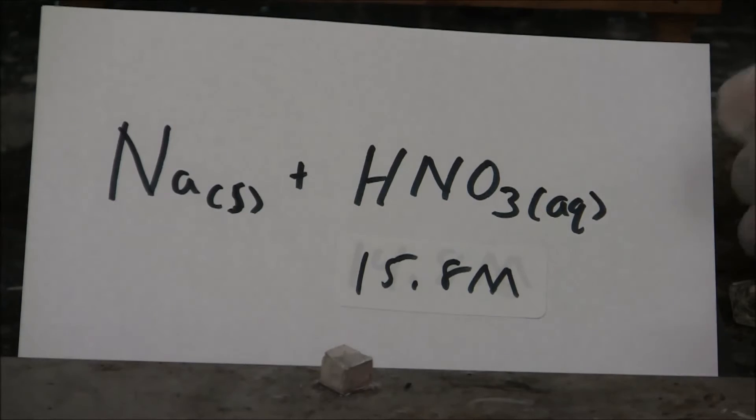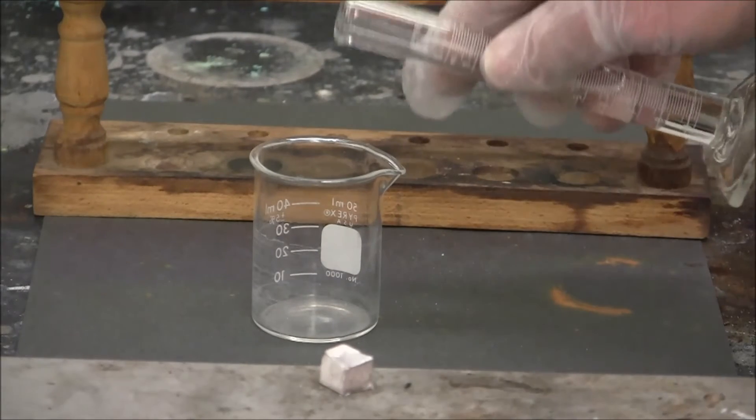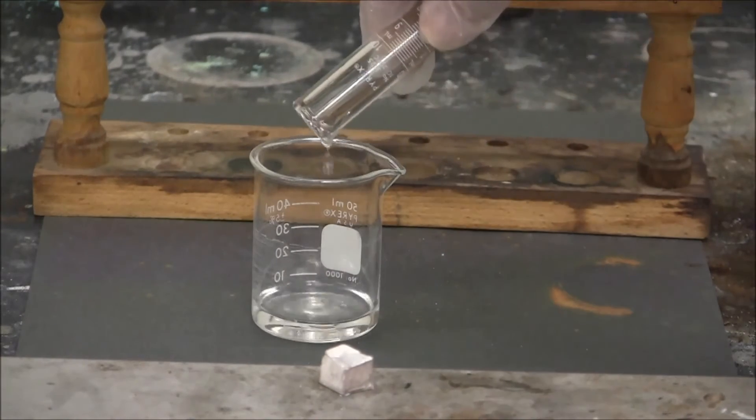Here we have sodium metal with concentrated nitric acid. In the graduated cylinder I have about 5 milliliters of concentrated nitric acid.